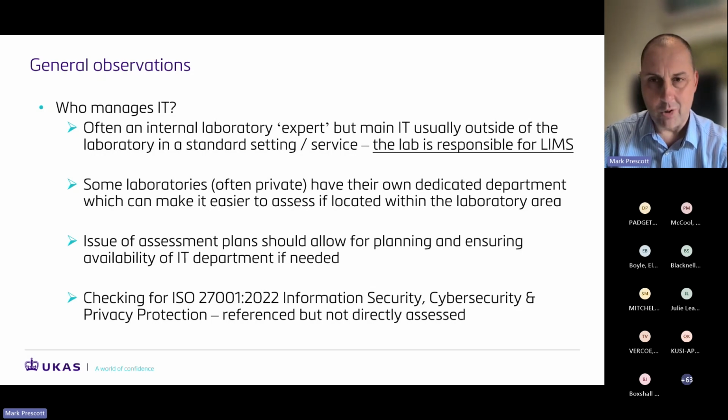The reason it's important is that even though we're not assessing it directly, it's always worth checking if your own IT department does have the certification to the standard, because it does cover many of the elements we're looking at with 15189, and you can almost take it as an assurance that if that certification is there, then your IT system is going to be fit for purpose in terms of security and those aspects.